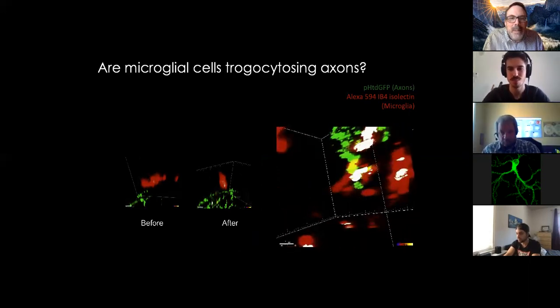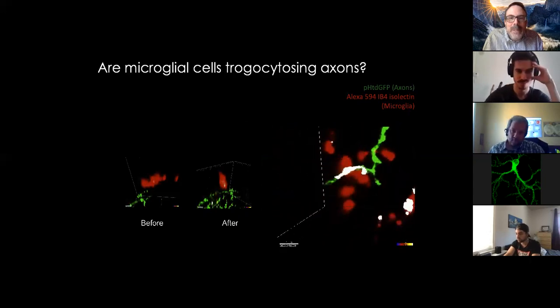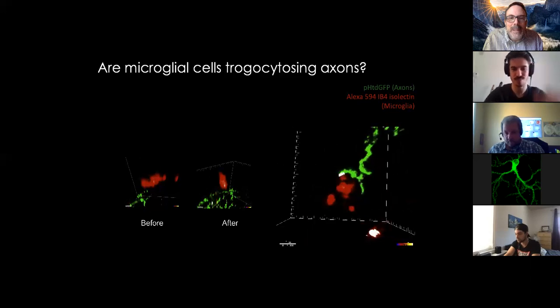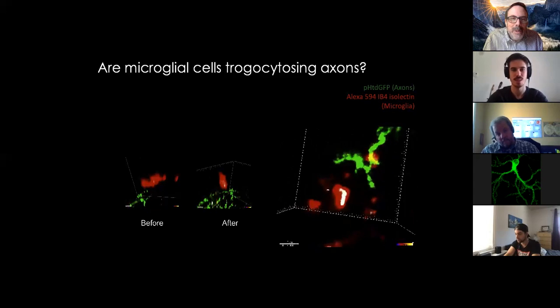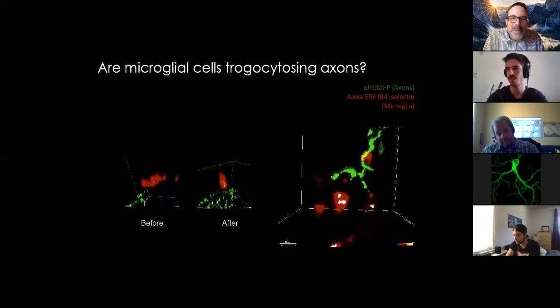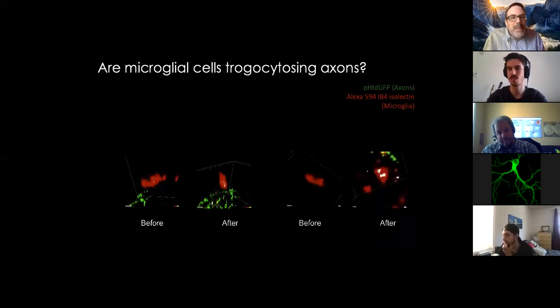So here's an axon that comes in, spends some time interacting. Sorry, a microglial cell spends some time interacting. It wasn't green at all when it came in, and now it's wandered off with a bit of green associated with it. So this could be an increase of autofluorescence. It could be the actual transfer of GFP from the presynaptic cell to the microglia.